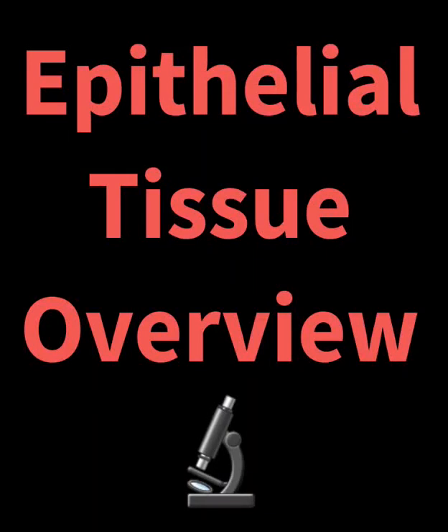Hello everyone, so for this video I will be showing you how to identify the different types of epithelial tissue when you're looking at them under the microscope.